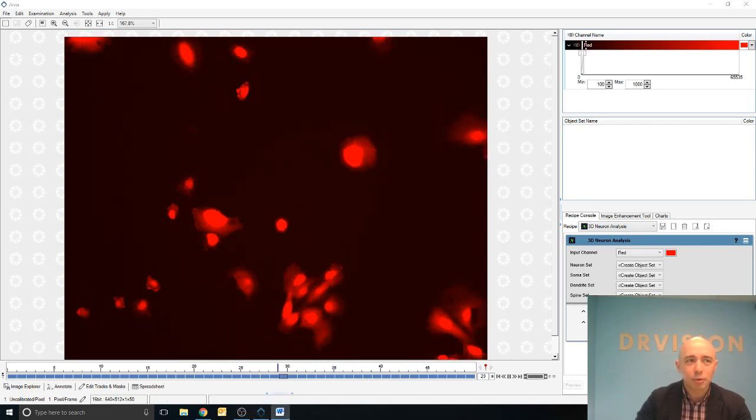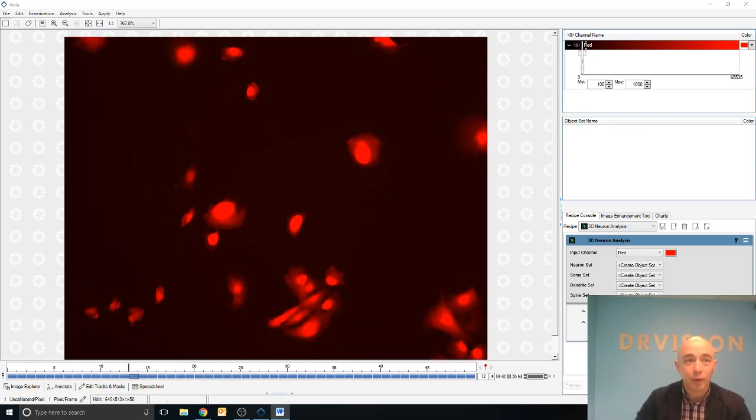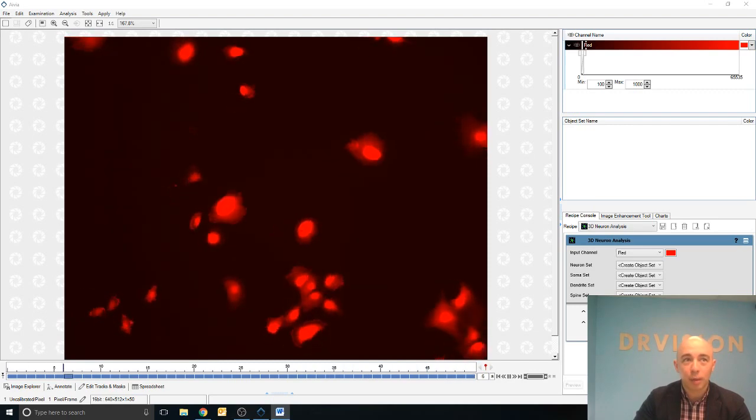All of the principles and adjustments we have made to single frame images so far in this webinar can also be made to time-lapse images, though there is often a trade-off. With so many images in a time-lapse sequence, it may not be feasible or even possible to accurately adjust every single frame so that the parameters are perfect. The trade-off we have to make is to generally select parameters that look good applied to the entire sequence.